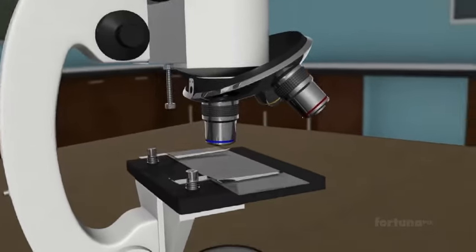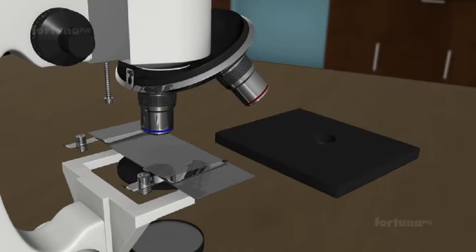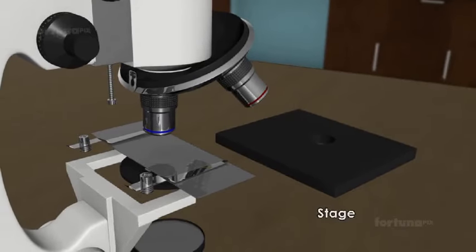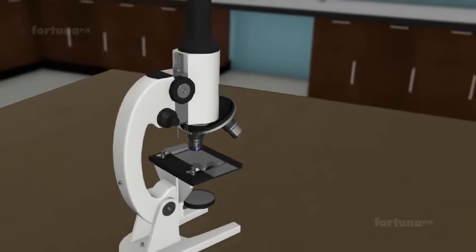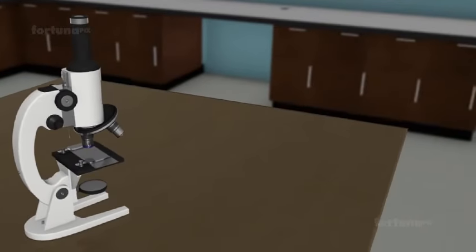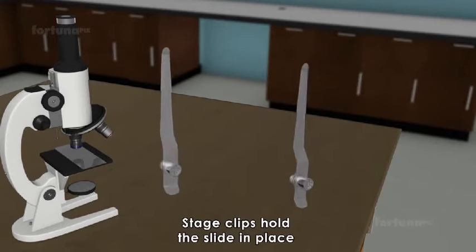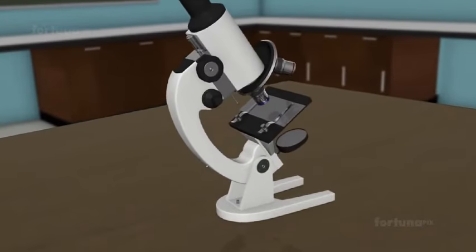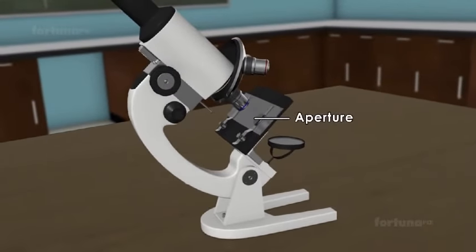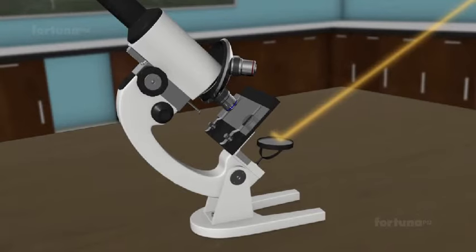Below the objective sits a flat platform known as the stage. On the surface of the stage, two stage clips hold the slide in place. A small aperture is present in the stage, allowing light into the body.